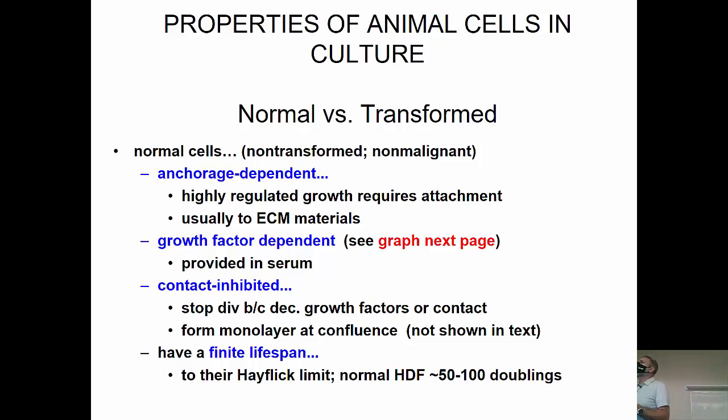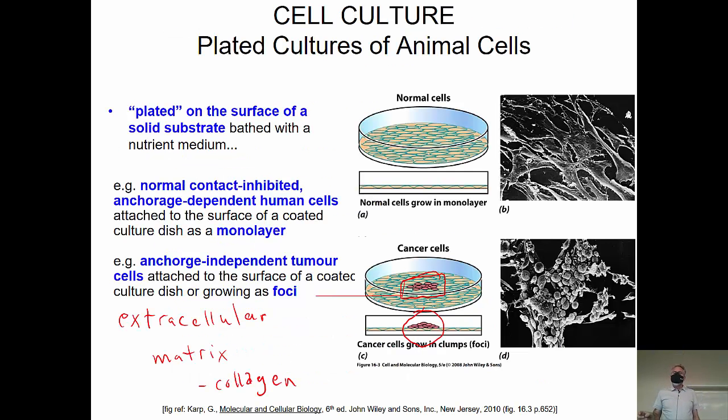Yes? Can you repeat what is a foci? A foci is just a specific or a small area, a concentrated area. And on this particular slide, shown in the red, there's a little clump of cells that are growing more than a monolayer high, so we can call that a foci. Because when you're growing the culture, they'll first show up as those foci, and you might get multiple on a plate, and then they'll continue to sort of grow up from those foci.